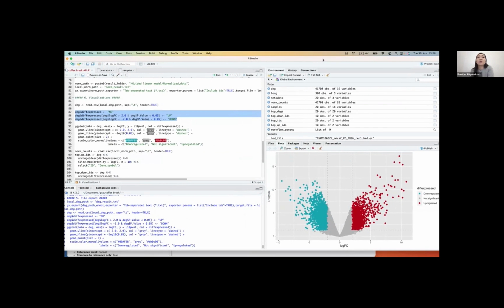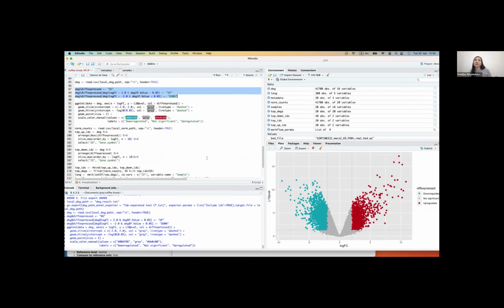There are visualization tools inside the platform which you might want to use, but if you want to create your own visualizations for your research, like for your paper, then ggplot and Bioconductor give a lot of commands and tools to do nice visualizations.